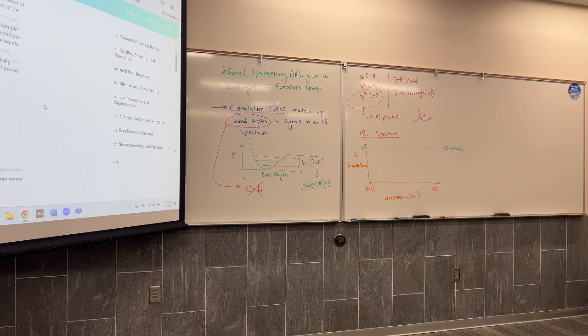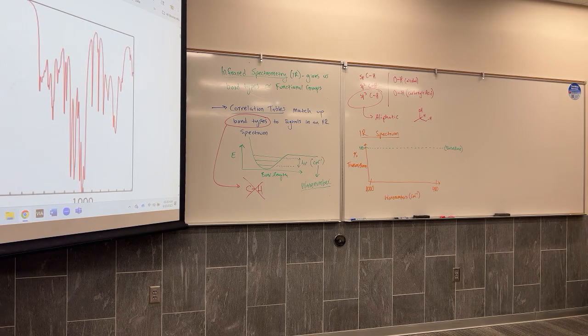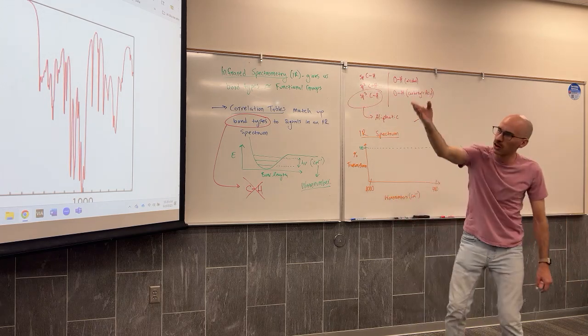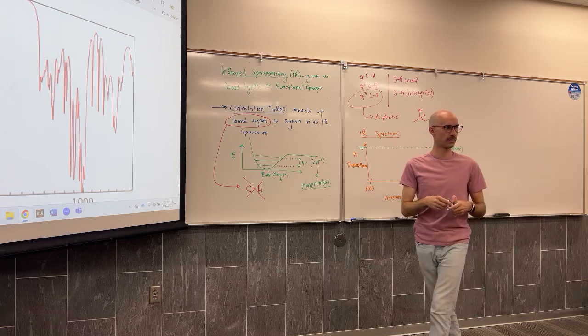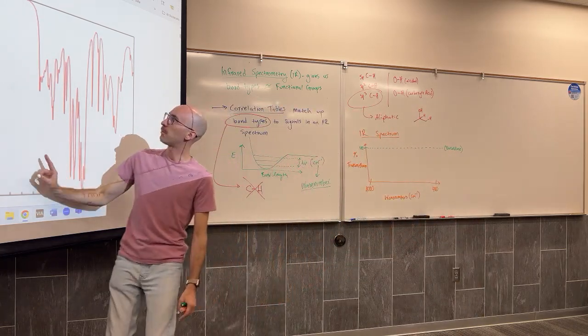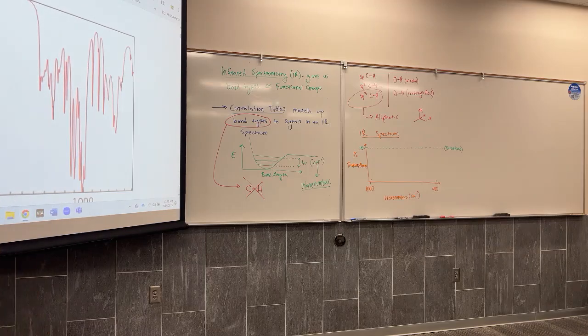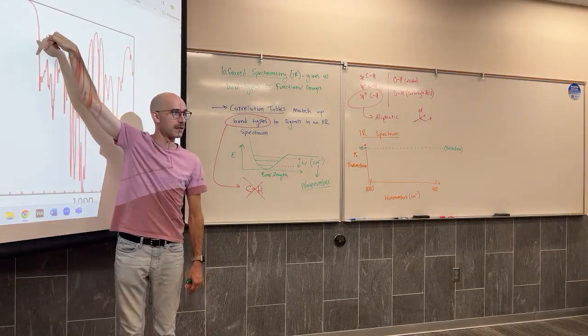Yeah, I always do this badly. Do you see a straight line across the top? Oh, you see all of these dips. And I do want to direct your thinking about it. These are not peaks that come up from the bottom. These are actually dips, peaks that come down from the top.